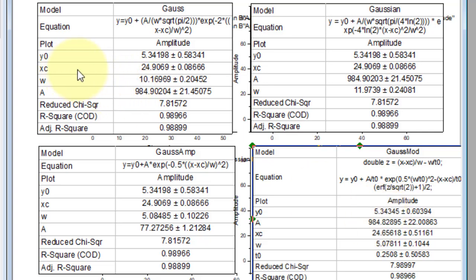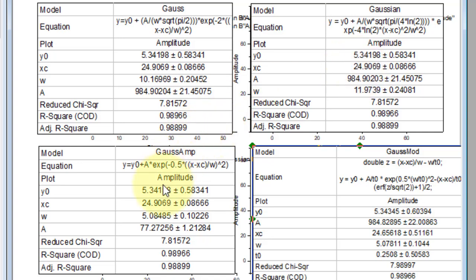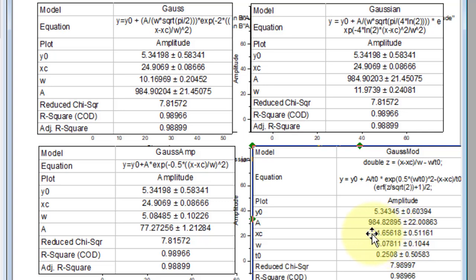Next, we examine xc, the center of our curve. It is 24.9069 and similarly, the others also show the same value except this one, which is slightly different but close to the others.